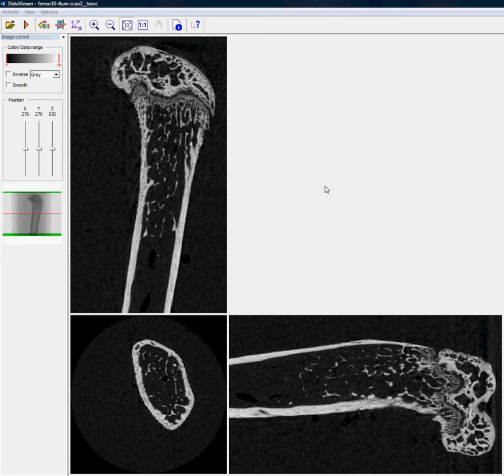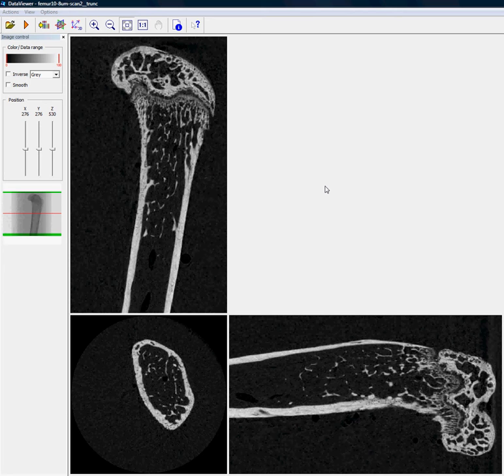Hello. Skyscan Data Viewer versions 1.4 and above have an important capability to rotate and reorient a dataset in three dimensions. This can be important to maximize the consistency and accuracy of morphometric measurement.